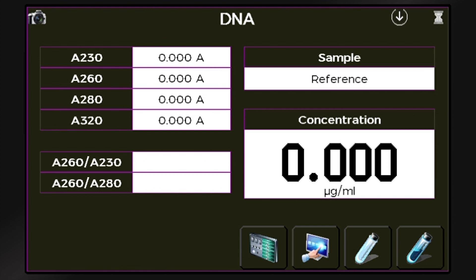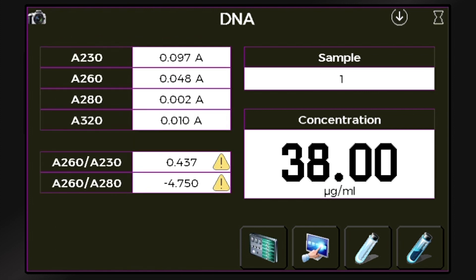The Biodrop displays results in both graphical and numerical formats. It also gives an indication where there might be an issue of purity. You can see here the yellow triangle against some of the results. This doesn't edit the actual results, but it does give users an indication where they might need to look more closely.